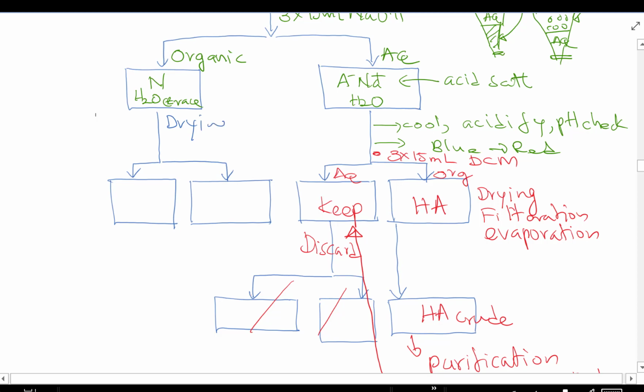Okay, these two boxes we don't need. We look at the organic layer then with the neutral. So we are not drying right away because we need to wash with sodium chloride, sometimes you call brine. You can do this washing with 2 times 15 milliliter of concentrated sodium chloride, get rid of the ions, and then you have aqueous and organic fraction, right?